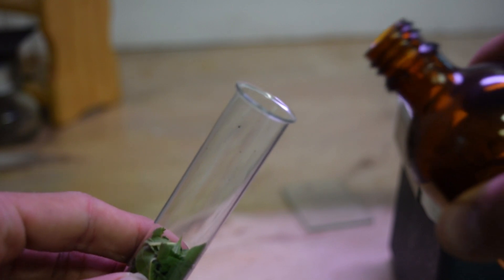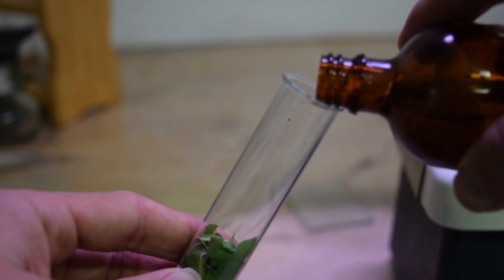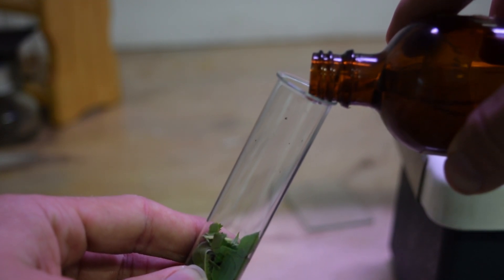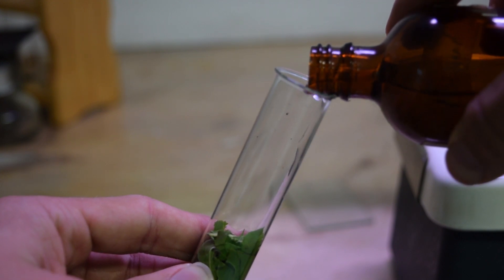The first thing to do is to tear up some green leaves and put them into a test tube. Now we need to put an organic solvent that can dissolve chlorophyll into the test tube. We're going to be using ethanol in this experiment. Put enough ethanol in the tube to cover all the leaves.